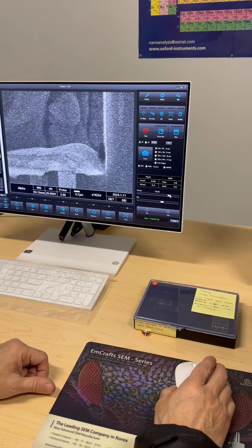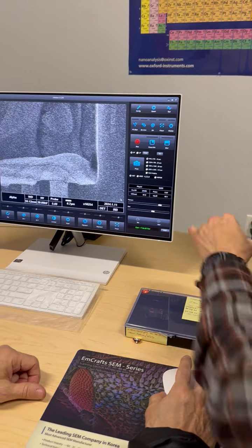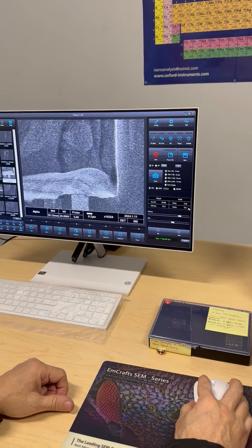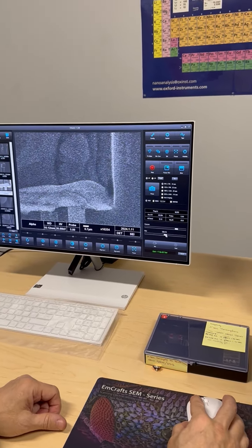That's fixed — don't worry about that for right now. When we put a new filament in, we set that and that's it; you don't have to do anything with it. That's the bias. When do you use low, and when do you just leave it? If I turn it down it changes the value — I want that to be over 100.